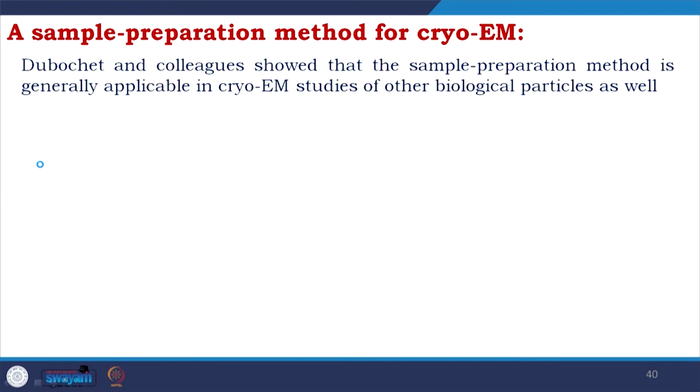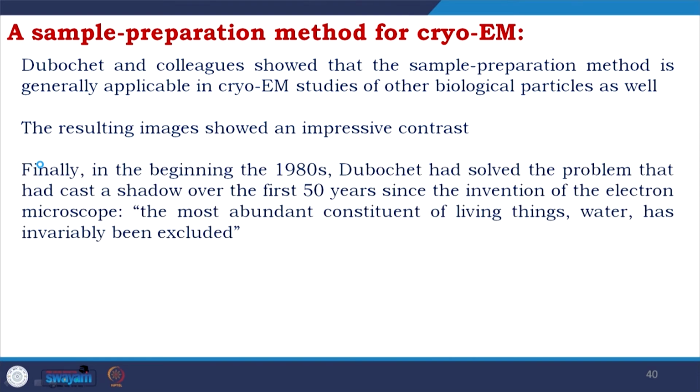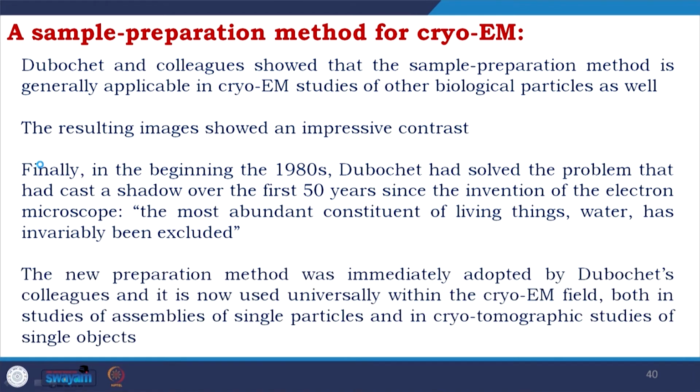Dubochet and colleagues showed that the sample preparation method is generally applicable to cryo-EM studies of other biological particles as well. The resulting images showed an impressive contrast. Finally, in the beginning of the 1980s, Dubochet had solved the problem that had cast a shadow over the first 50 years since the invention of the electron microscope: the most abundant constituent of living things, water, had invariably been excluded. So, this is the final kind of step.